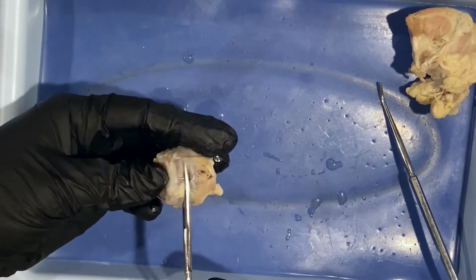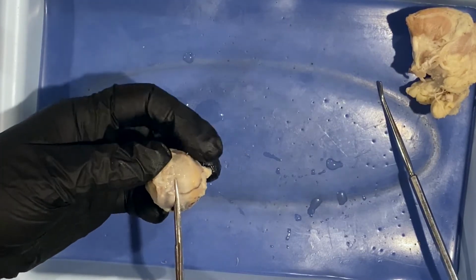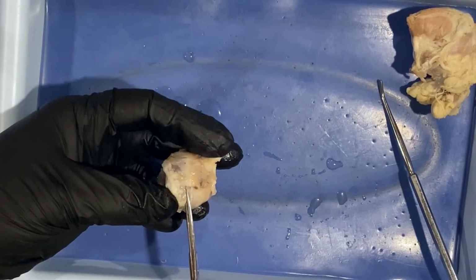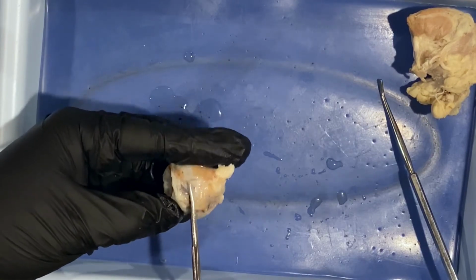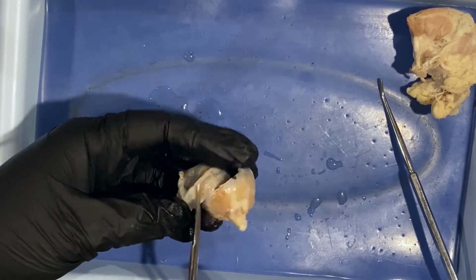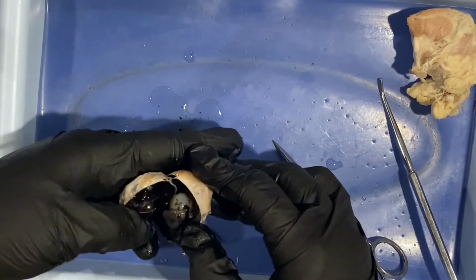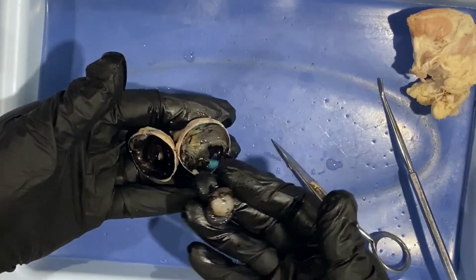And as I'm doing this, there is fluid inside the eye. That fluid inside the eye serves a couple different purposes, one of which is to maintain the shape of the eye. The other is to continue to bend the light. So as I'm working my way around, you'll see that we have separated this into an anterior and a posterior portion. And as I did that, the lens actually came loose.